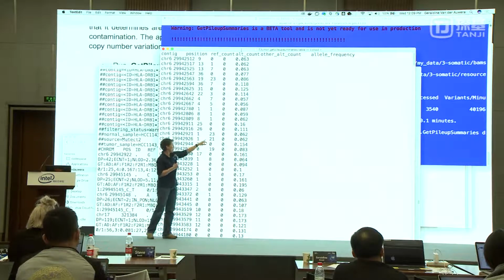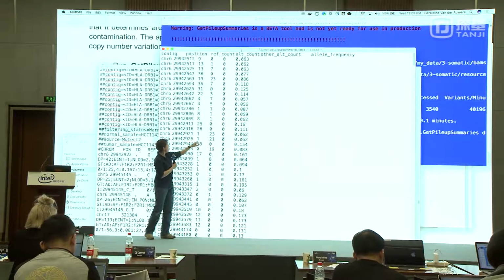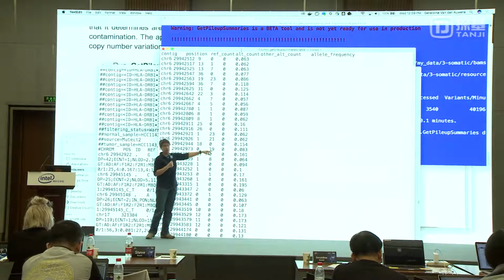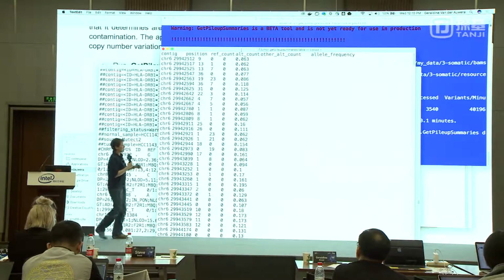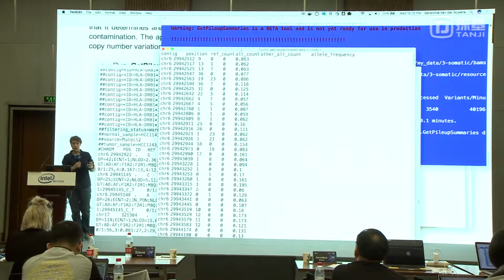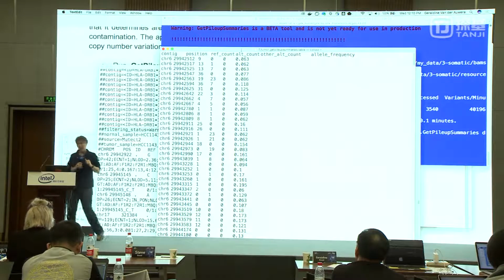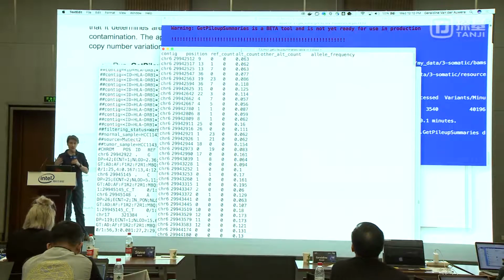So we have another one with the same case, and that's probably the same read since they're really close by. And then here, for example, we will have some sites where there's no reads. And so we'll take that subset of all the sites that show evidence of being probably homozygous variants, and then evaluate based on how many of these potential contaminant reads, what is our rate of contamination, the estimated contamination in the overall thing. And that's how we get that result.